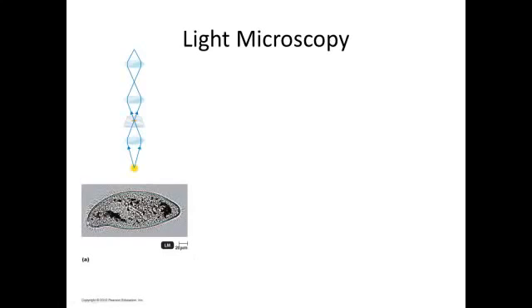This particular micrograph was taken by what we call a bright field microscope. This is the type of microscope that we use in lab. It's a good workhorse variety of microscopes. They're inexpensive, they're useful in most applications, and they do the job. Light goes through and is blocked by the thicker portions of the sample, showing up as dark spots. And it's a positive image, to use a photography term.